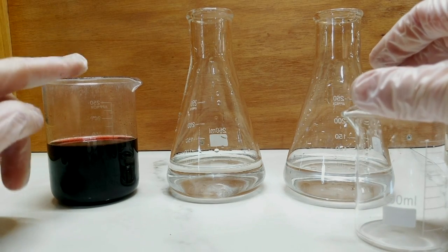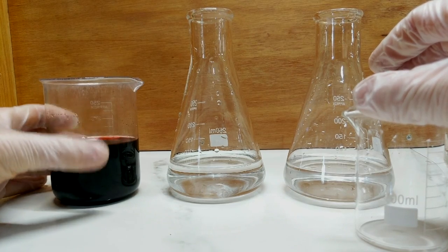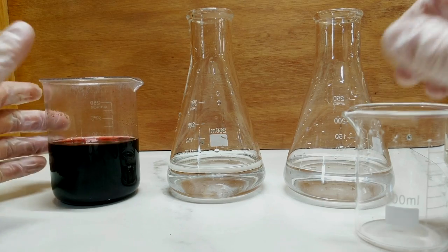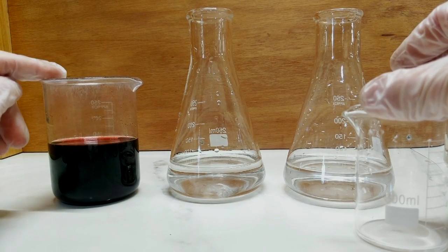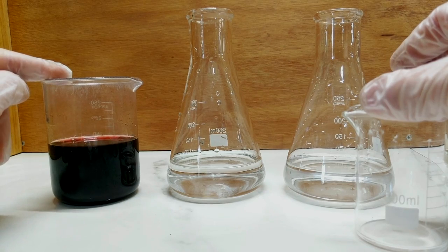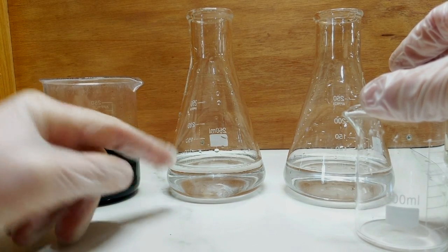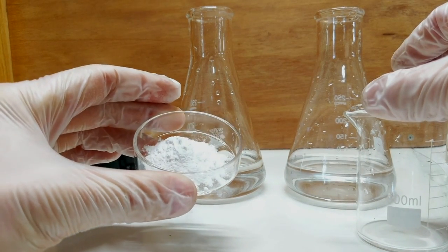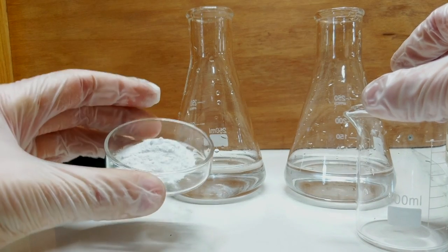So what I have here in the beaker is a fairly concentrated solution of cobalt chloride. There was 30 grams of carbonate went in there. Basically what I'm going to do is take a small amount of my concentrated cobalt chloride solution and add it to an Erlenmeyer flask that I'm going to put some monosodium phosphate into.